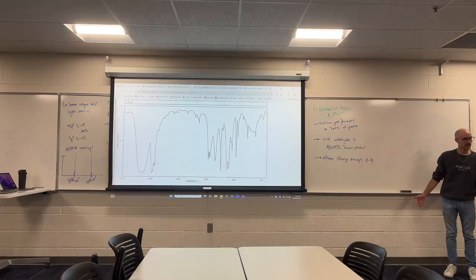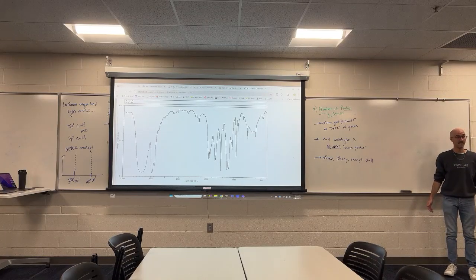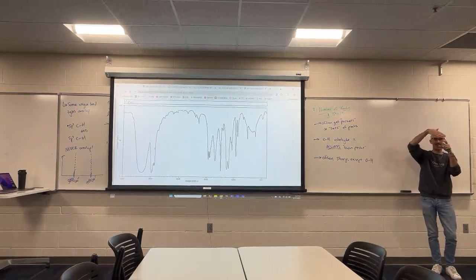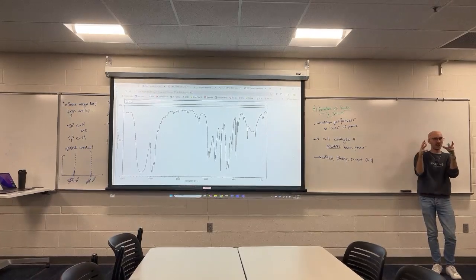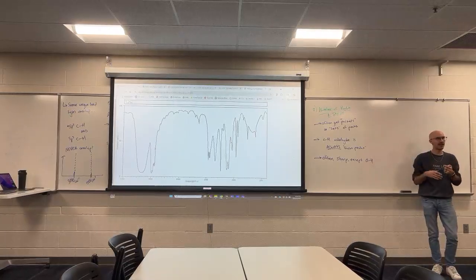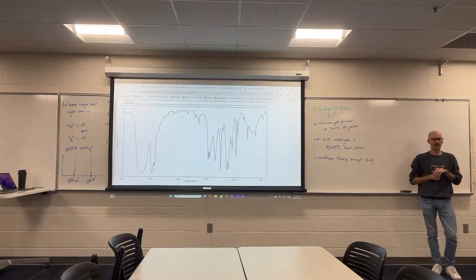Talking about electronegativity? Yeah, kind of. I'm just thinking what we've talked about in the past. I think I saw this the other day. Because of the forces, it's a hydrogen bond. Yeah. Hydrogen bonding with other molecules in the sample being analyzed. So I'm looking at an OH bond, true, but I'm also looking at an OH bond that is interacting with a neighboring OH bond. So the nature of my bond depends on how concentrated the sample is, how close one molecule is to another molecule, and how it being hydrogen bonded is impacting the other bond types.